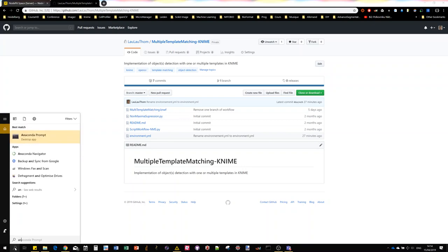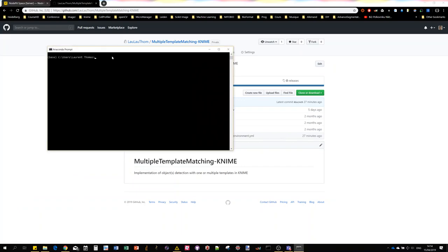You can download those two files and once you have it on your local computer, if you have already Anaconda installed, then you can open the prompt, type conda environment create dash f for file, and then the name of the environment file dot yml. This has to be typed in the folder containing this environment file.